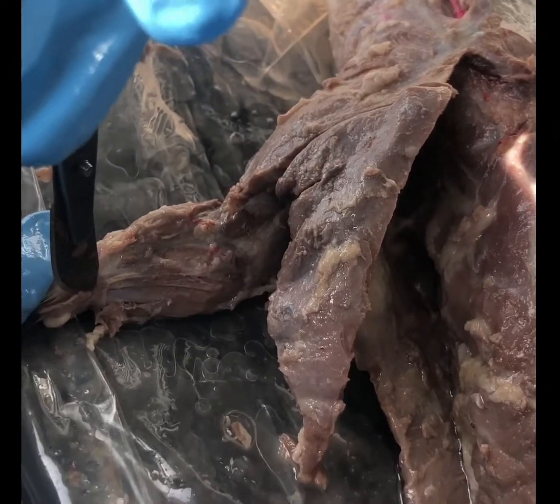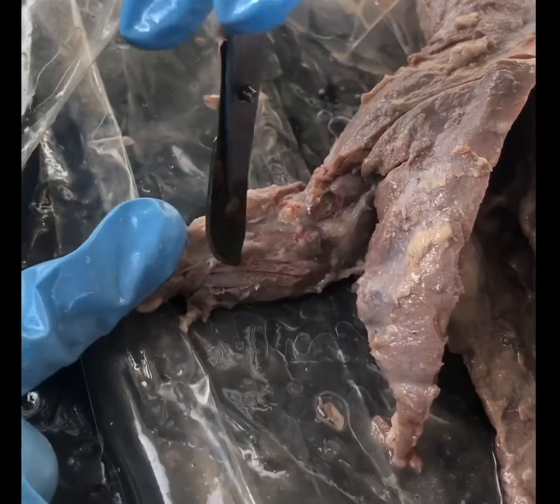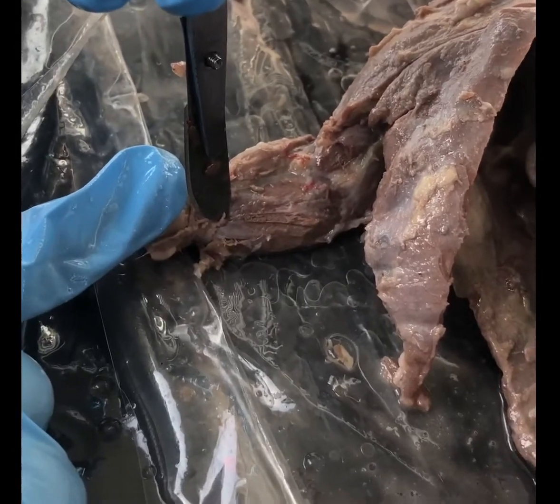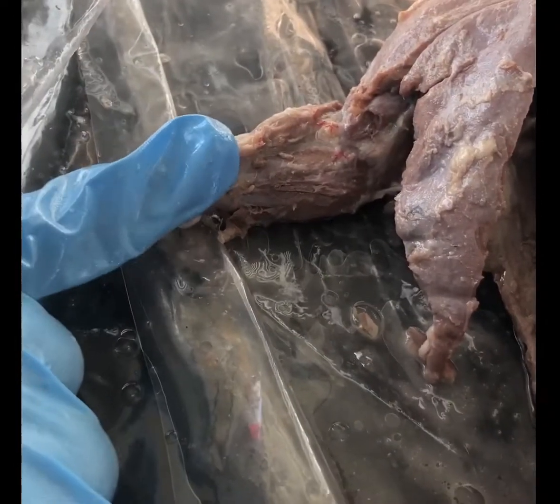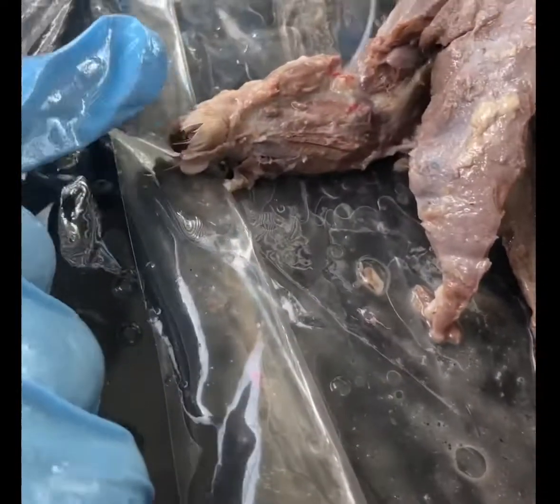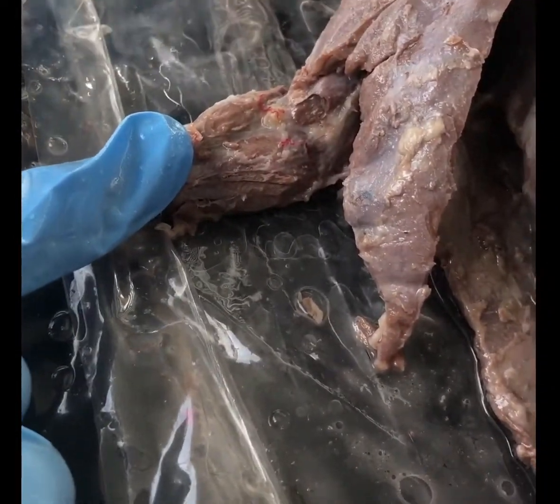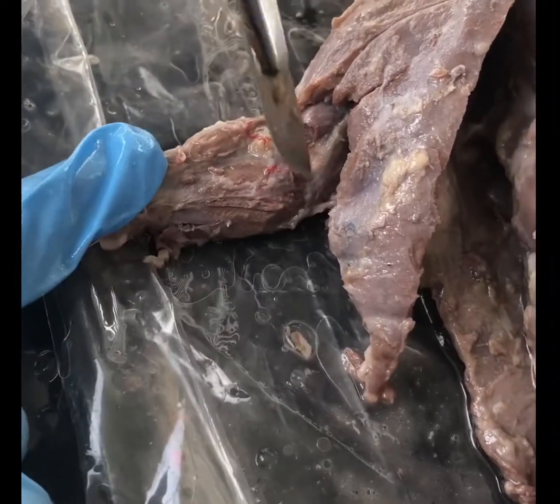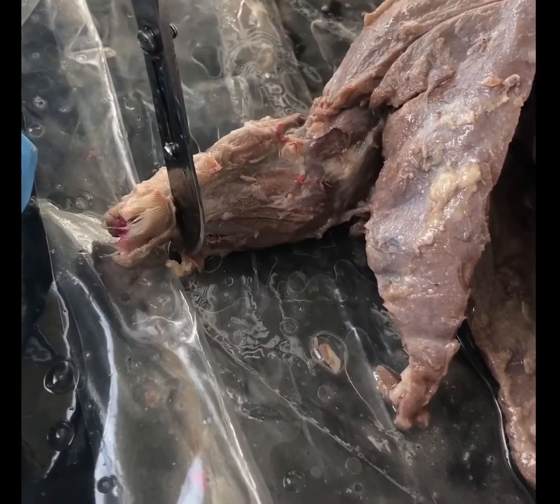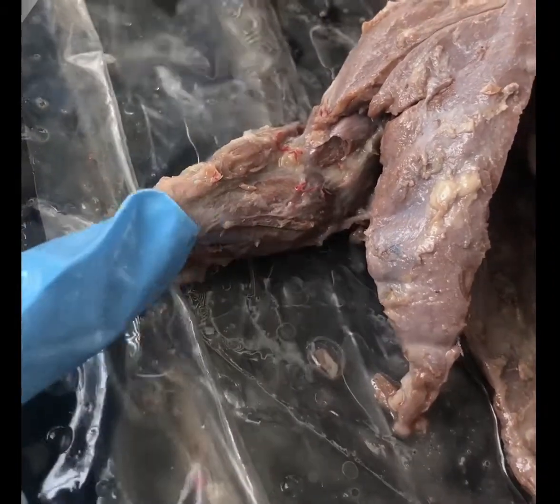The palmaris longus, which flexes the wrist also, is in the same area, and it goes straight down. The flexor digitorum superficialis flexes the digits 1 through 5, and it also goes from the elbow to the wrist. So the extensor carpi radialis brevis is right on top of the radialis, so it goes from the elbow straight down to the wrist. The extensor digitorum is right at the center from the elbow.